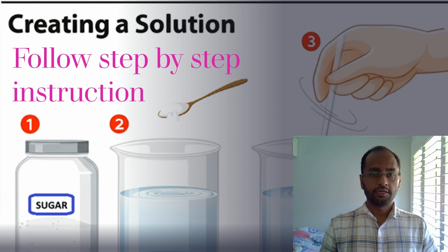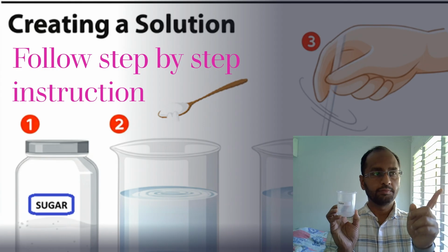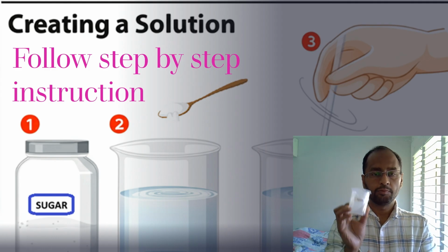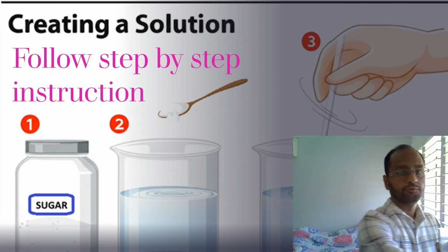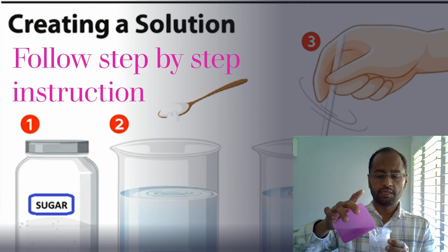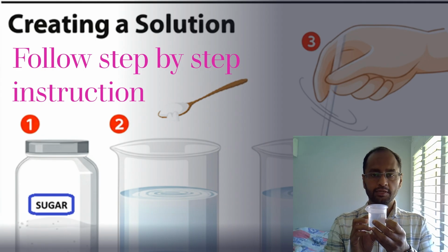Great. Okay. Now, step number two, you need to label your beakers hot, warm, and cold. Use the labels and the markers right over there. So you'll have three beakers, each one with a clear label. Firstly, you will pick up the warm beaker and fill it up with 200 ml of water. So how do you know 200 ml? Just up to the top mark here. So you fill it up to the top, and there you have it. Okay, the warm water beaker is labeled clearly.